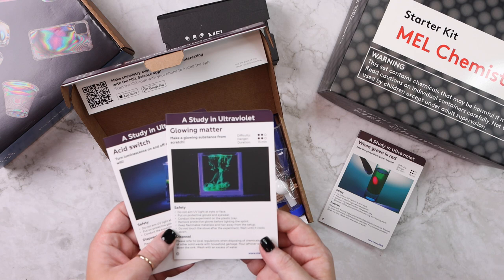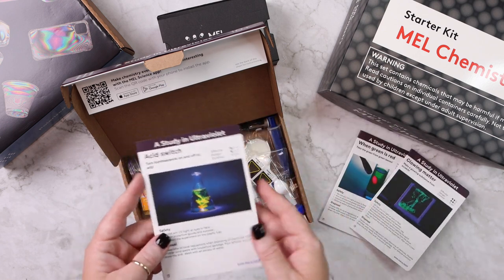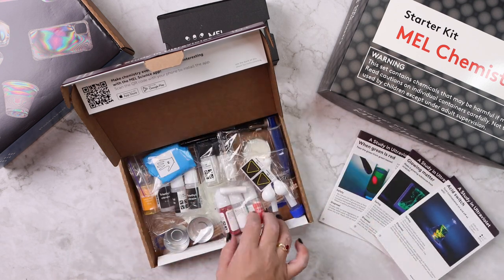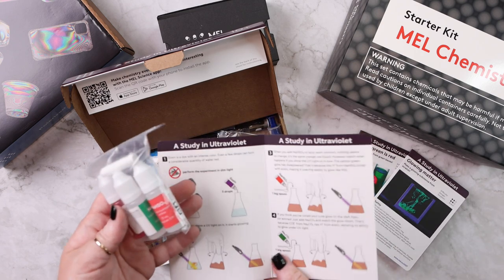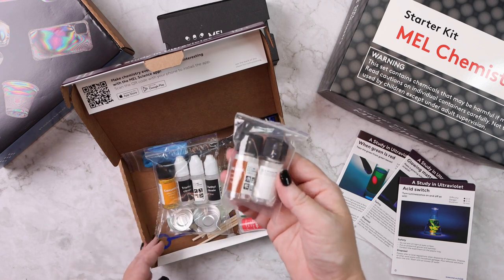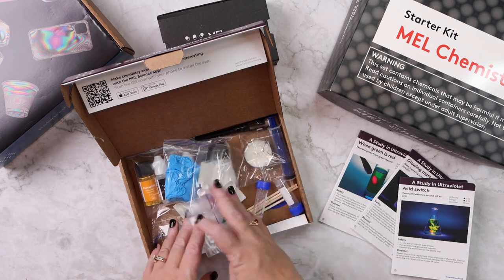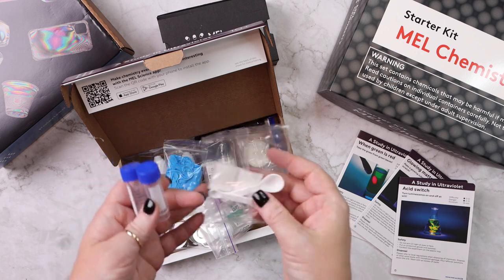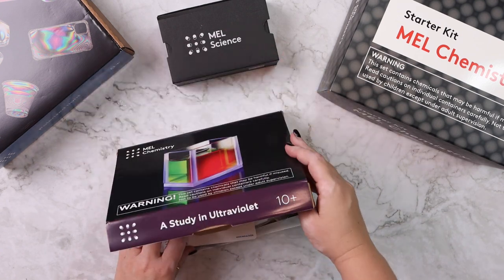This box also includes 'Glowing Matter — make a glowing substance from scratch,' with a QR code to scan, and 'Acid Switch — turn luminescence on and off at will.' It includes all of the chemicals, bagged up very nicely so each bag has everything for one experiment. It always includes gloves so you don't have to worry about having those on hand. Anything else needed — like smaller beakers or scoops — is included too. The only thing I've ever seen you need to go get is maybe a paper towel or a little bit of water.